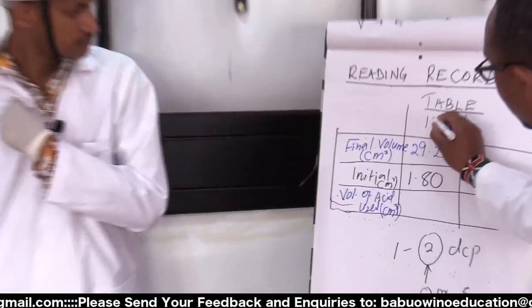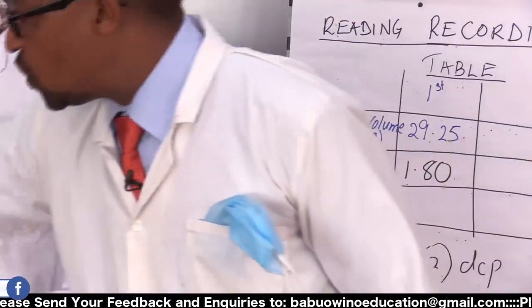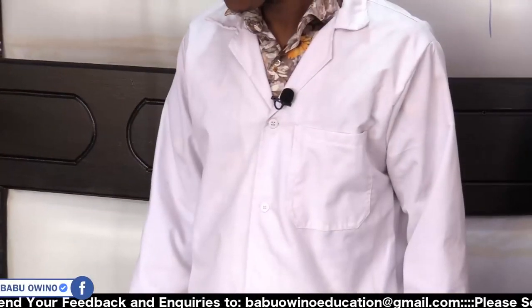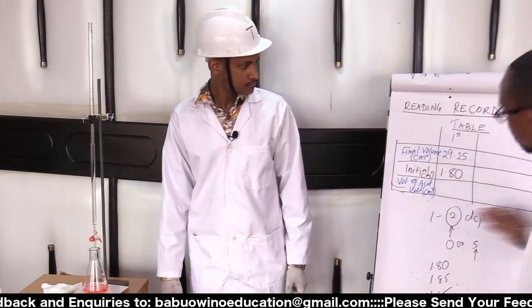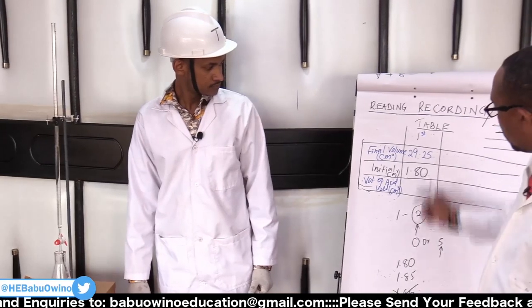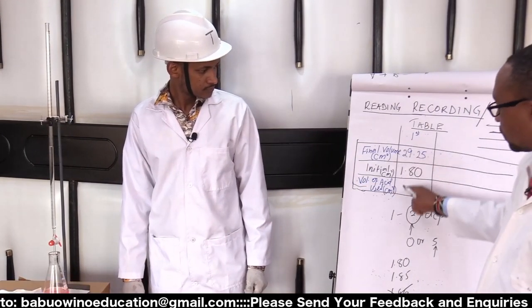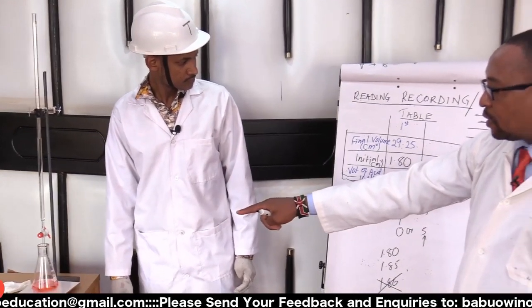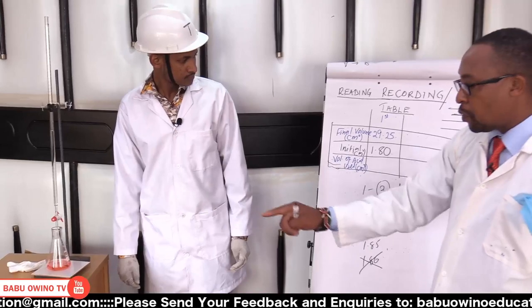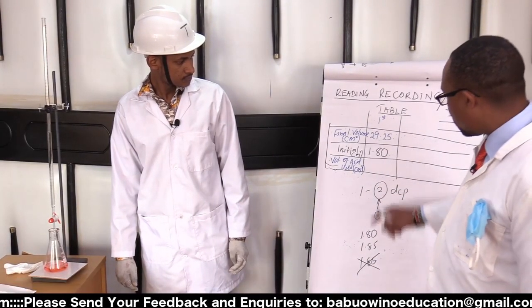So in this exercise, what is here from the burette is a titrant. What we get here is a titer, and the process is therefore titration. We are analyzing what is in the conical flask from the pipette, which is the analyte. So we do the subtraction.